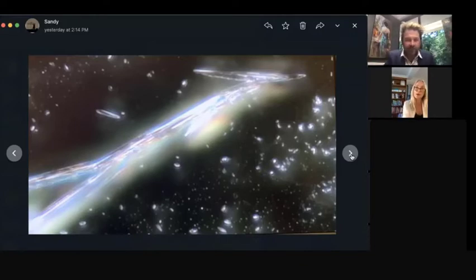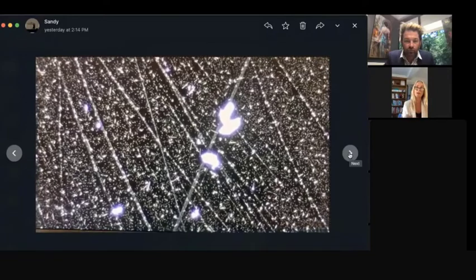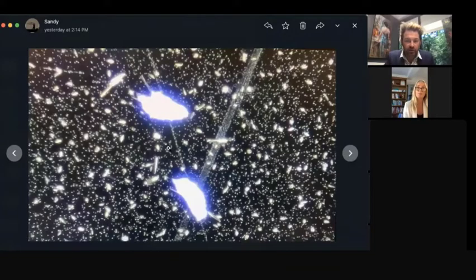I'll try to get as much detail for you in that picture, but when you're actually looking down the eyepiece of the microscope, you see so much more detail as well. But I just had to snap that as soon as I was able to, because it was just beautiful. And there are all different sizes of the zeolite. Well, and then we'll go here. Yeah, so these little pieces here would be probably about 1/5 the size of the first one we just saw, the one that looked like a spaceship. Most of them, I'd say about 85-90%, are at this size, and then you get slightly smaller ones and slightly bigger ones. And you can see that ultraviolet light coming off them.